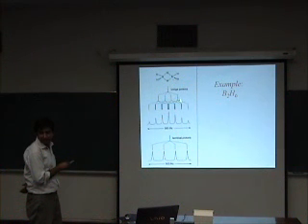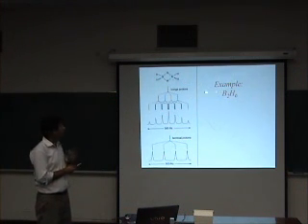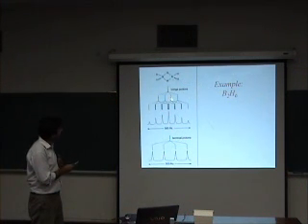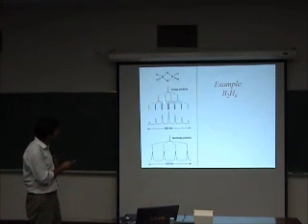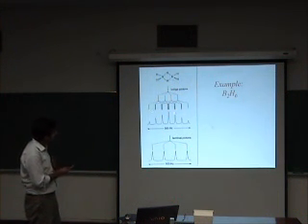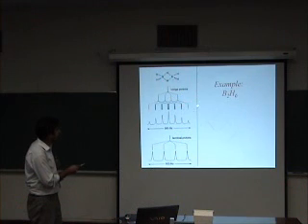Each of the bridging protons is coupled to 2 borons. Boron is a spin 3/2 nucleus. So as a result of the first splitting, you get 4 lines. As a result of the second level of splitting, you get additional 4 lines. As a result, you get this multiplet pattern, which is in the ratio of 1 to 2 to 3 to 4 to 3 to 2 to 1.